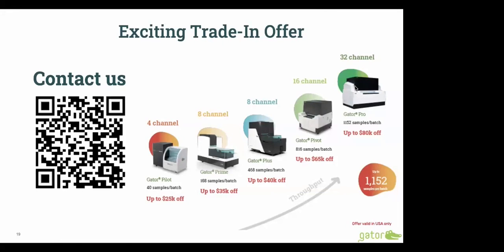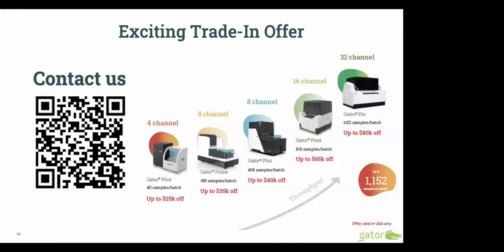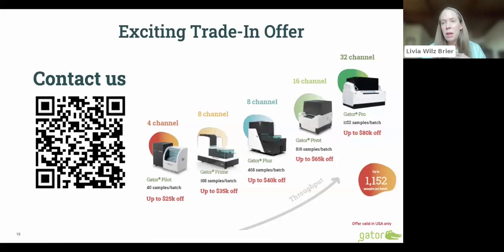You've already explained it, Livia, but one instance where that also happens is if the affinity is too tight. In the dissociation phase, you can also see some rebinding if the concentrations of the analyte are too high. That's another reason we see curves like that. Yes, with our multivalent protein polymer conjugate, we often do see a slight uptick, and a lot of it depends on having a really low-noise signal in your buffer. For us, we have a Gator Pro. The Gator Prime wasn't quite ready yet, but I do know the Gator Prime can really help with some of that drift. At least that's what I was told.